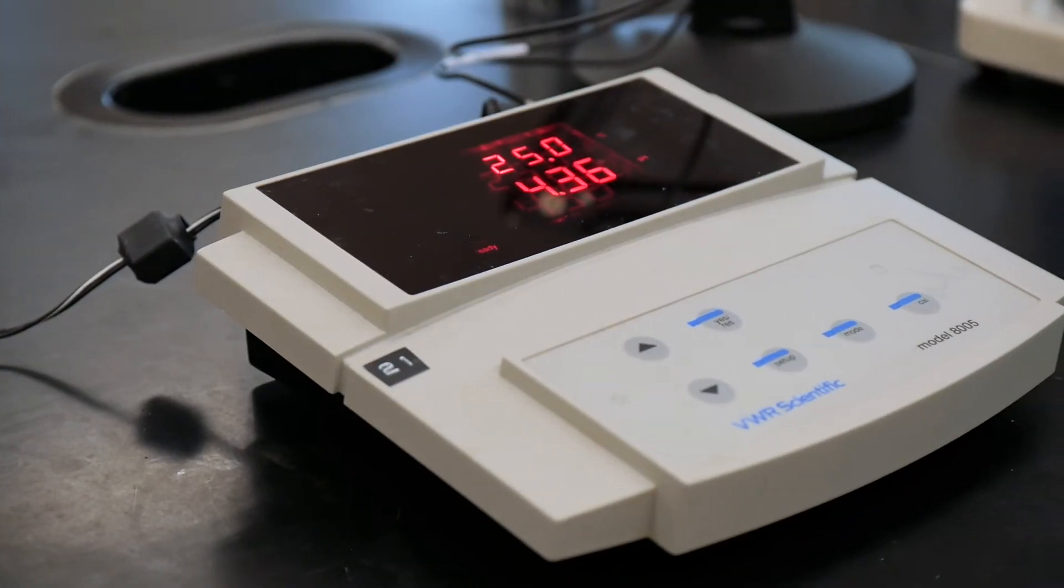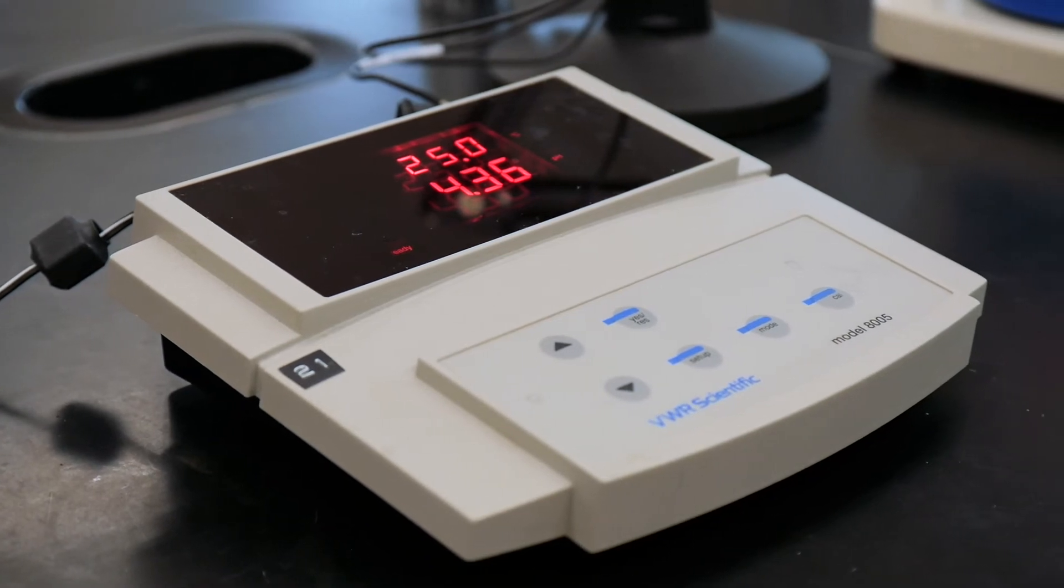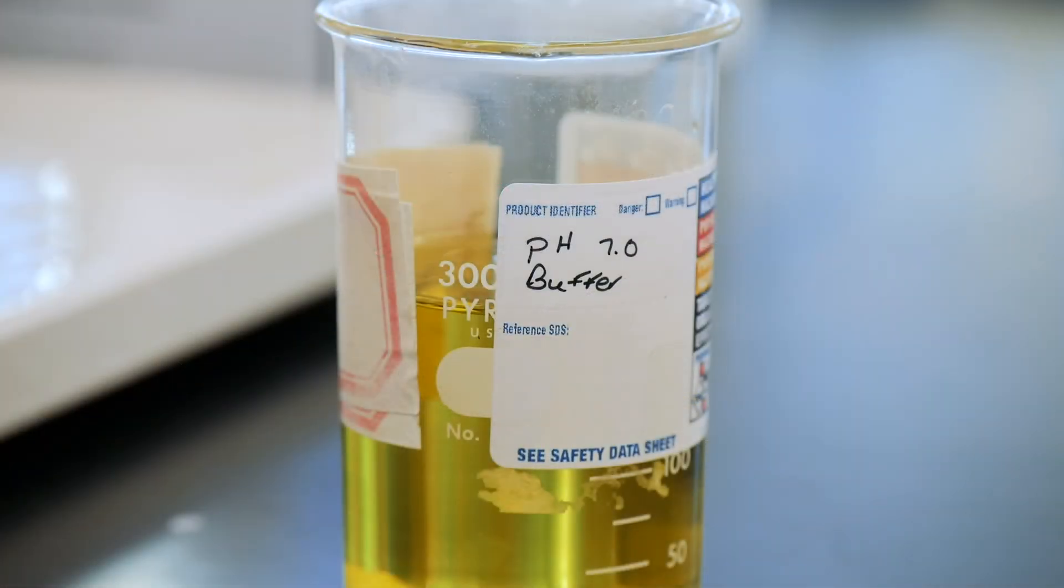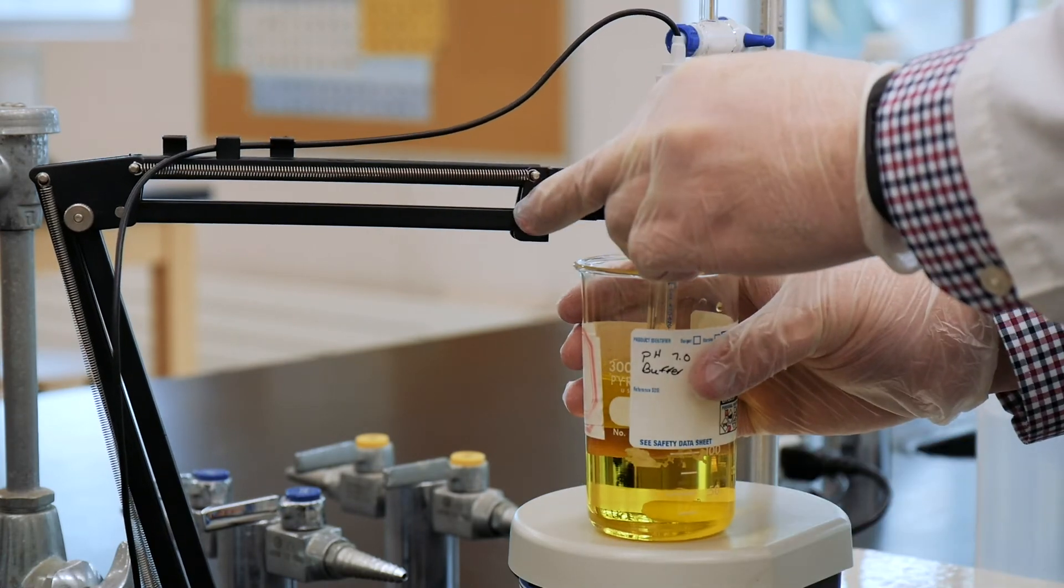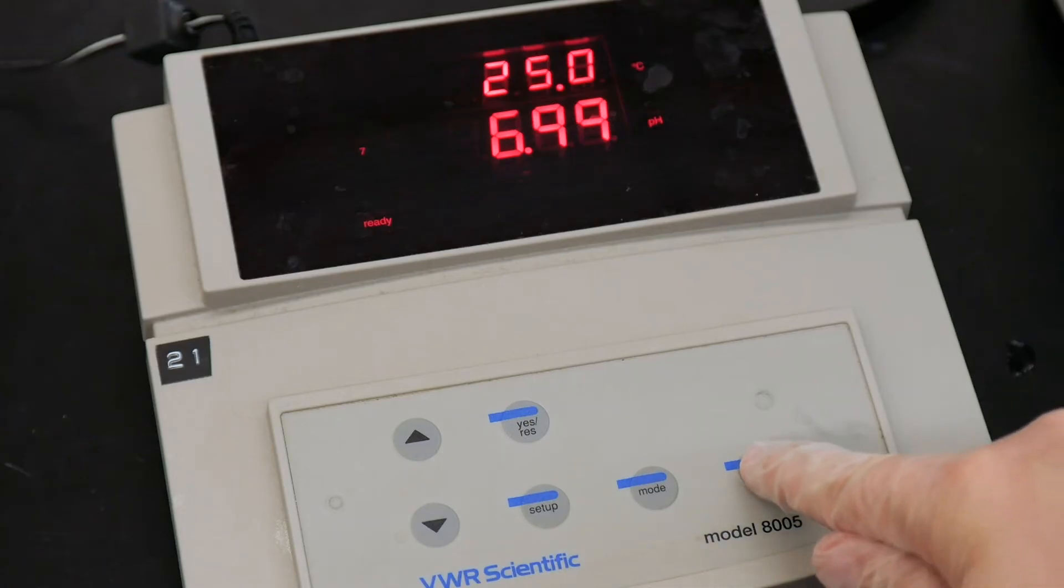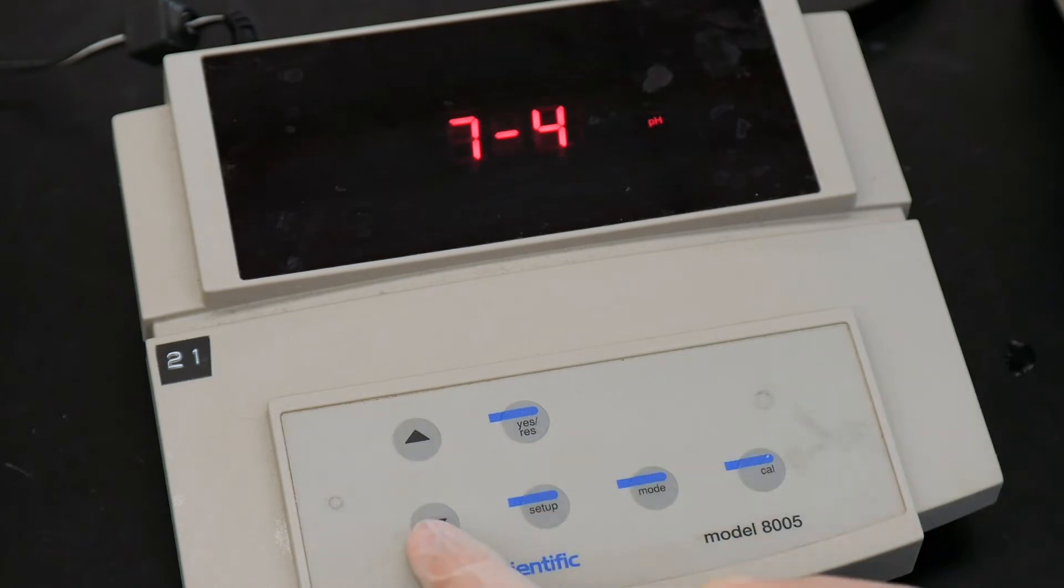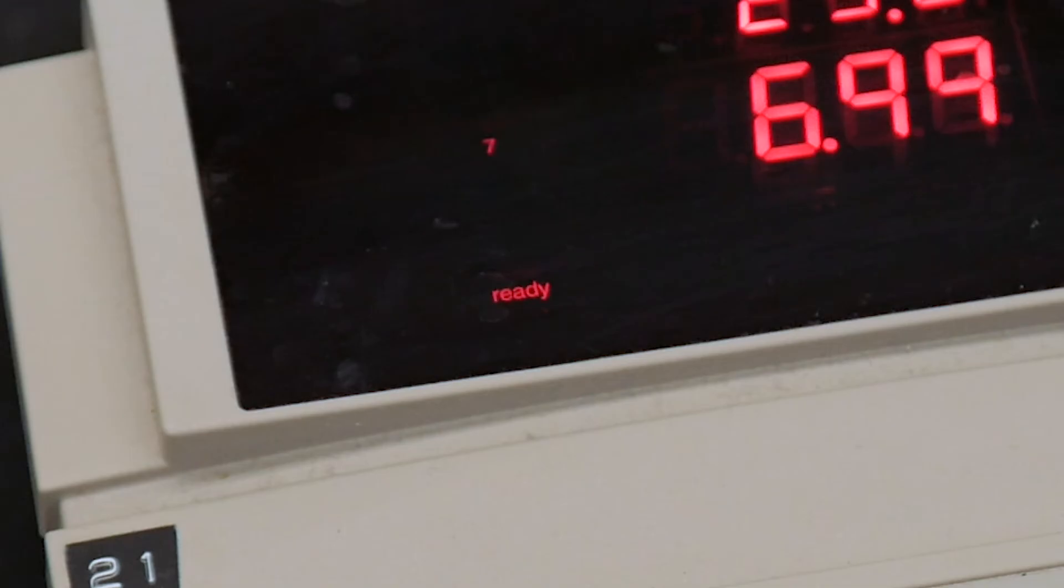Before we get started today, you'll need to calibrate the pH meter. To do that, a buffer solution that has a known pH of 7 is provided. Place the pH electrode in that buffer solution and press the Cal button, followed by the Up or Dn buttons, until the screen reads 7 pH, like so. Next, press the Yes button, and the screen will read ready.